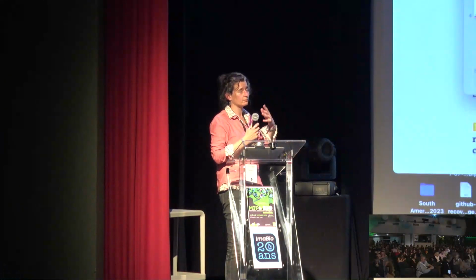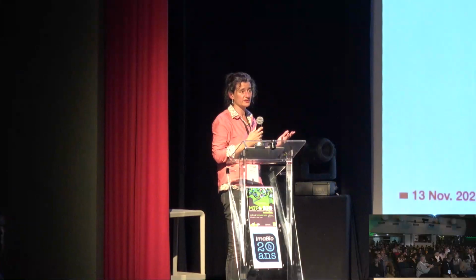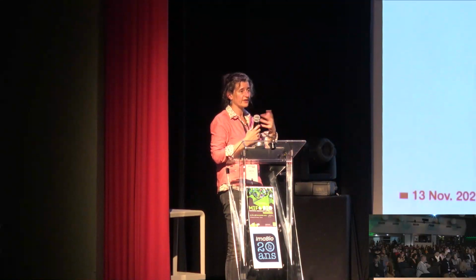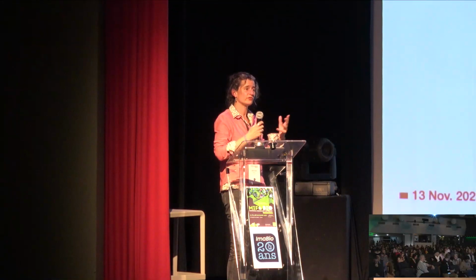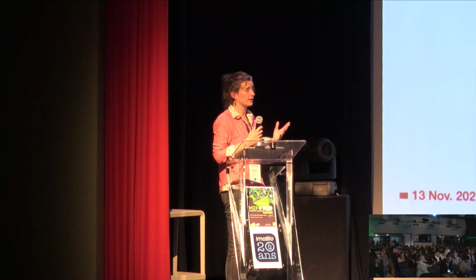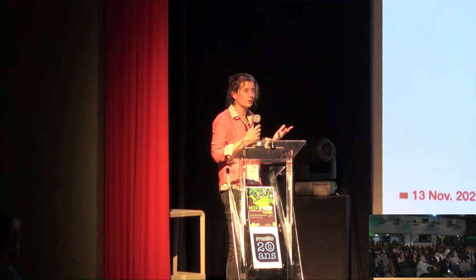But then when you are more interested in morphogenesis, again, it depends on the structure. Some structures are very quick to set up because the cells proliferate quite fast. So then maybe a day or two.